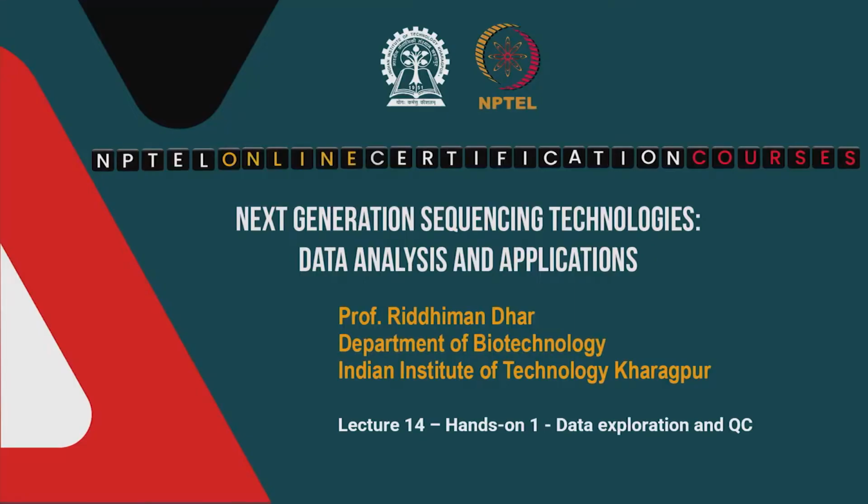Good day everyone, welcome to the course on next generation sequencing technologies, data analysis and applications. So far we have set up the system for the hands on and we have learned basic Linux commands. So, we will utilize those commands today to look at the data and then we will do the quality control of a test data. So, let us start.